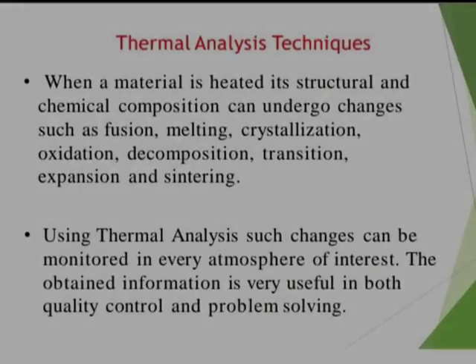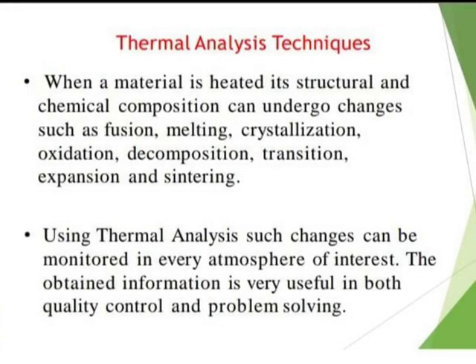Differential thermal analysis. Thermal analysis techniques. When a material is heated, its structural and chemical composition can undergo changes such as fusion, melting, crystallization, oxidation, decomposition, transition, expansion, and sintering. Using thermal analysis, such changes can be monitored in every atmosphere of interest. The obtained information is very useful in both quality control and problem solving.